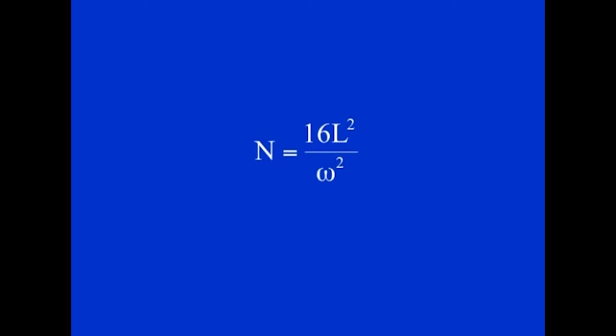Now, if we consider the position of a peak emerging from the column, so that x equals L, and from the knowledge that the width of the peak at its base, obtained from tangents drawn from the two steepest parts of the peak, equals 4 sigma, hence sigma equals 1/4 of the base width. So you can convert the previous equation to: number of theoretical plates equals 16 L square upon the base width square.